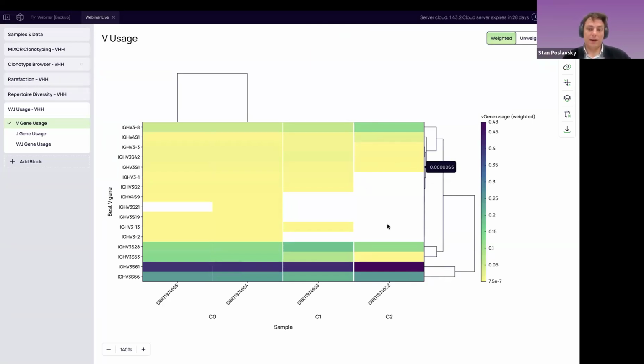It's definitely biased to a group of genes, depleting some of the combinations, which is a pretty good signal for us, because we aimed to select a diverse set of lead candidates. If we aim to select a diverse set of lead candidates, then we'll have a diverse set of genes enriched. Mark, by the way, this picture is typical for mammalian species, yeah? This kind of distribution.